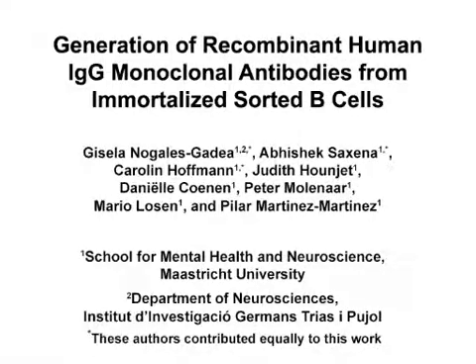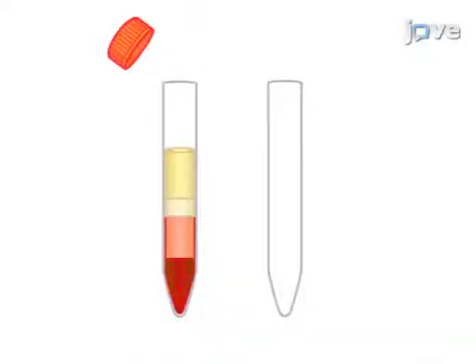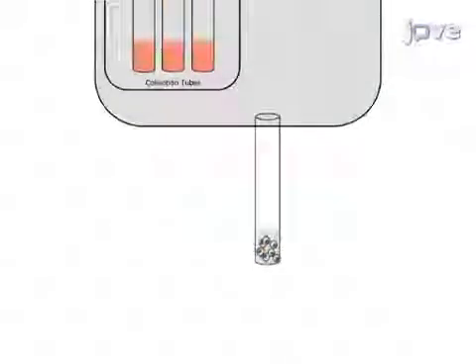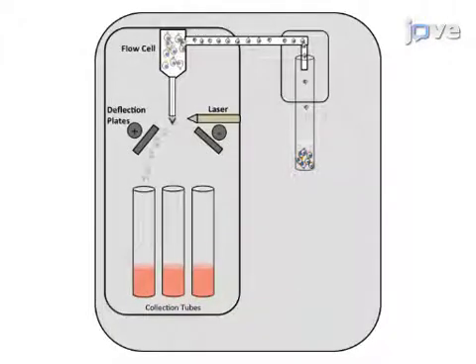The overall goal of this procedure is to clone and express antibodies produced by B cells. This is accomplished by first isolating B cells from a relevant source tissue, like blood or thymus. The second step is to perform FACS and select the B cell population positive for IgG production.